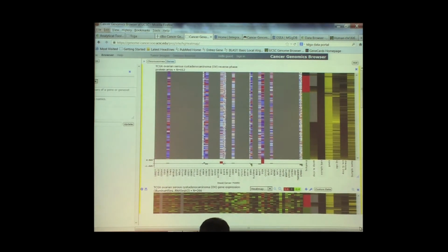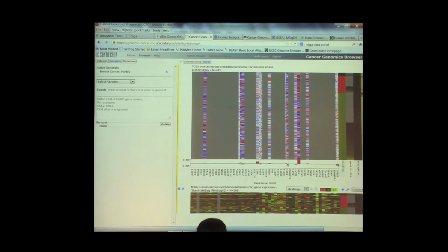Has everybody been able to get on now and interact? Or are we still waiting to get to the website? Yes. Click on gene. So up here, make sure that it says genes. Oh, I see. Yeah, it took me. I was like, why can't I get the O? Okay, and then it'll be under the add favorites.